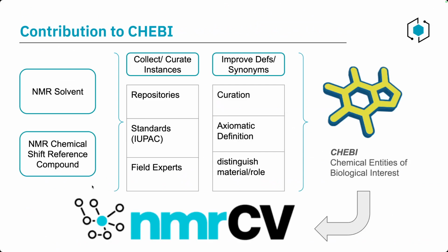And some of the areas we have focused on, first, the chemical compounds in nmrCV. As we mentioned, they were not supposed to be declared there. And the main compounds are NMR solvents and the reference compounds. So what we have done is collecting and curating different instances and individuals of these compounds from repositories, standards like IUPAC recommendations, and from field experts.